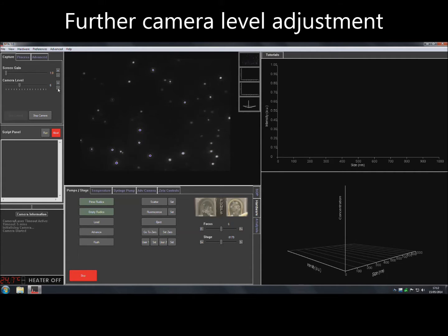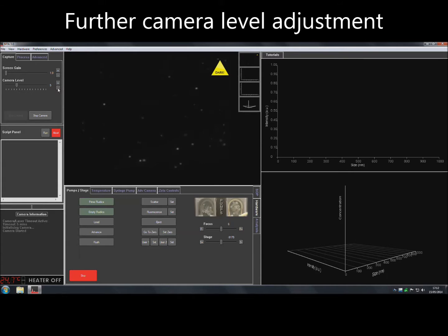At this point, further adjustments to the camera level can be made to ensure that the best image is obtained.